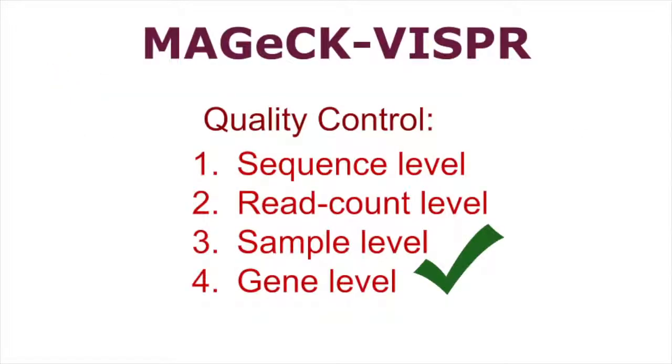You now know how Vispr displays measurements for four levels of quality control and how to interpret the measurements for your data. For more information on quality control and Magic Vispr, please visit the links in the video description below.